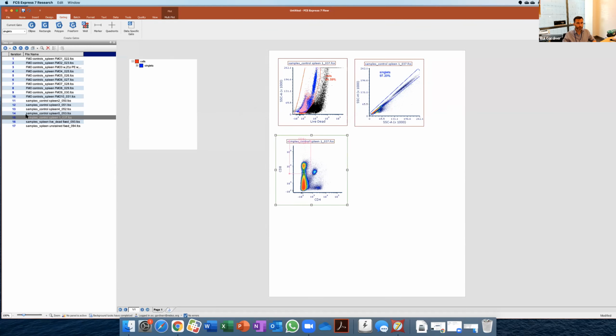Yes, Derek. You're probably going to go on to this actually, Rory, but I was just wondering whether everybody knows what an FMO is. Okay, good. So the FMO stands for fluorescence minus one, which basically means that you label with everything except the fluorochrome that you want to set the threshold between negative and positive, right? So in this case, I don't know exactly where to set the gate for CD8 and even for CD4. I mean, it may seem obvious that for the CD4 is here, for the CD8 is here, right? So without any controls, I would set the gate here, right?